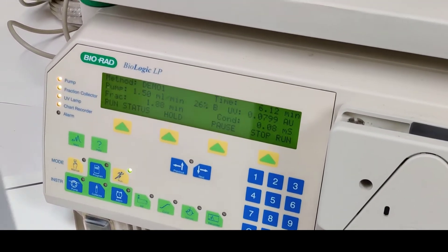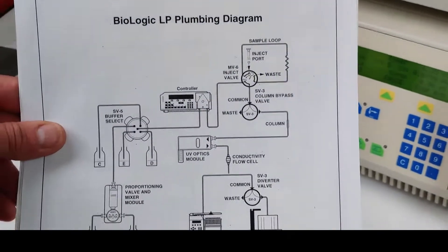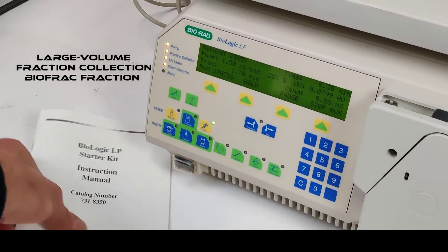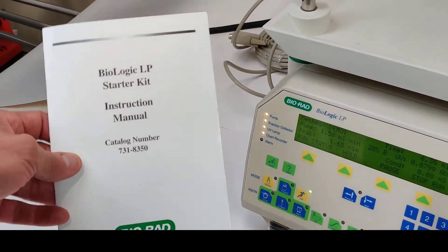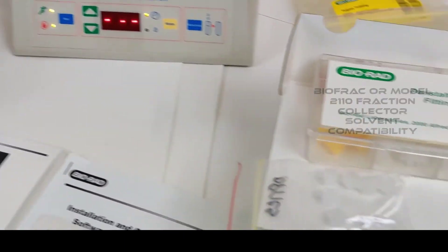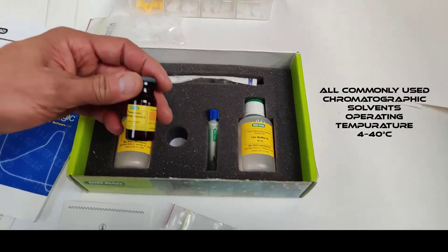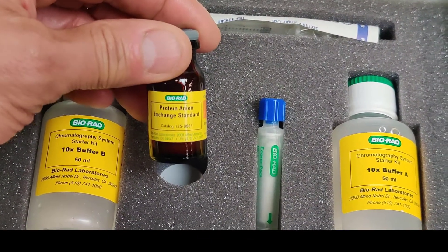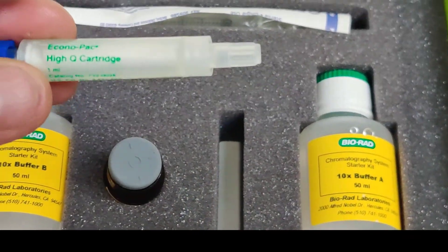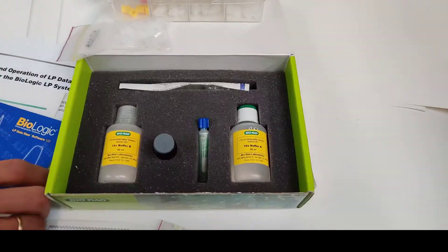We are plumbing the system as fitted for the install kit — we are running the starter kit. Here you have it with buffer A and B preparations, and you have a protein and ion exchange standard also. We have a high-Q cartridge in the install kit.